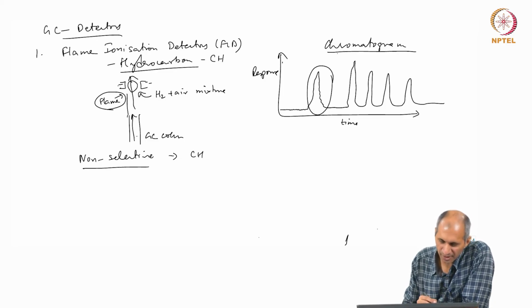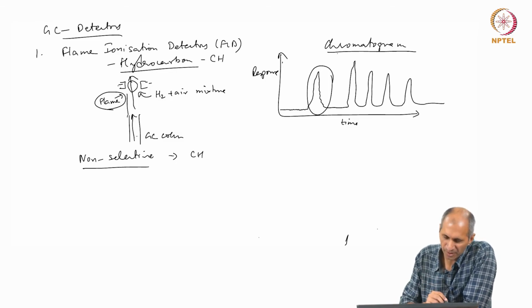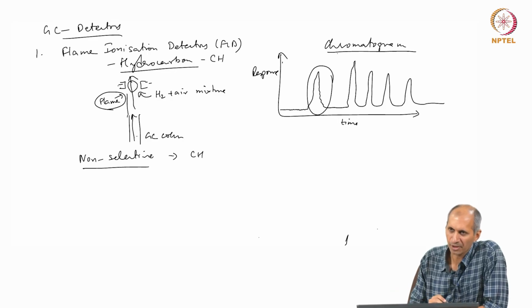So, what do you need to know if you are doing an analysis? We have two things that we do in chromatographic analysis. One is called qualitative analysis.